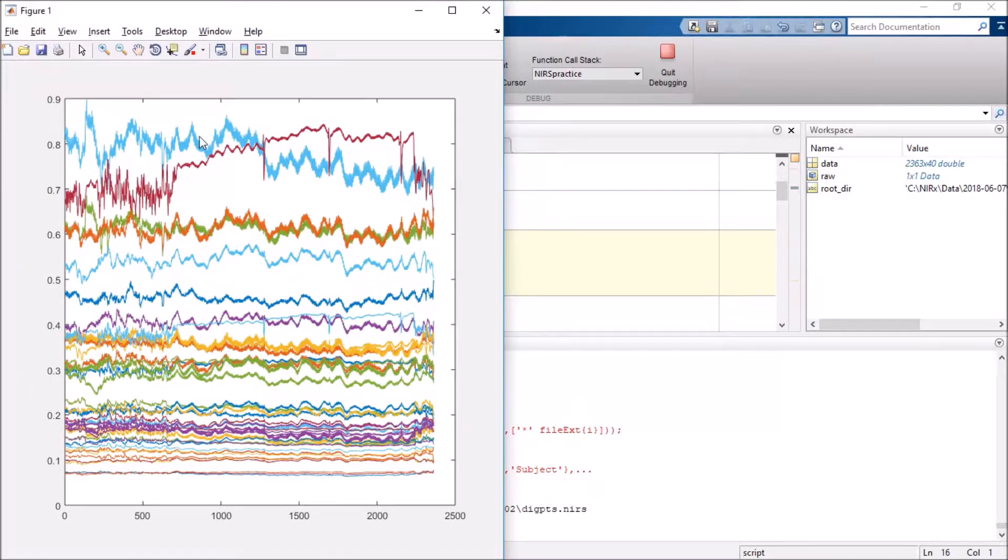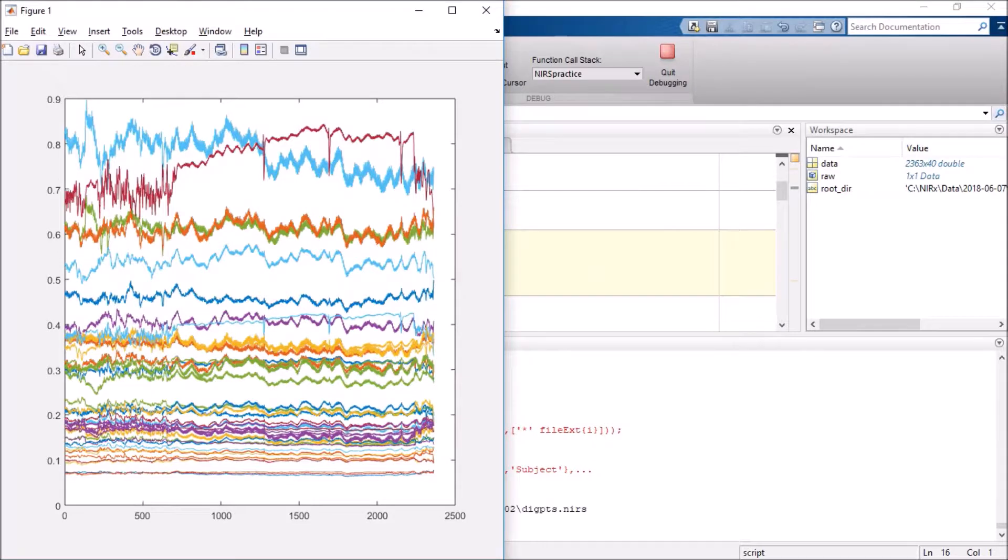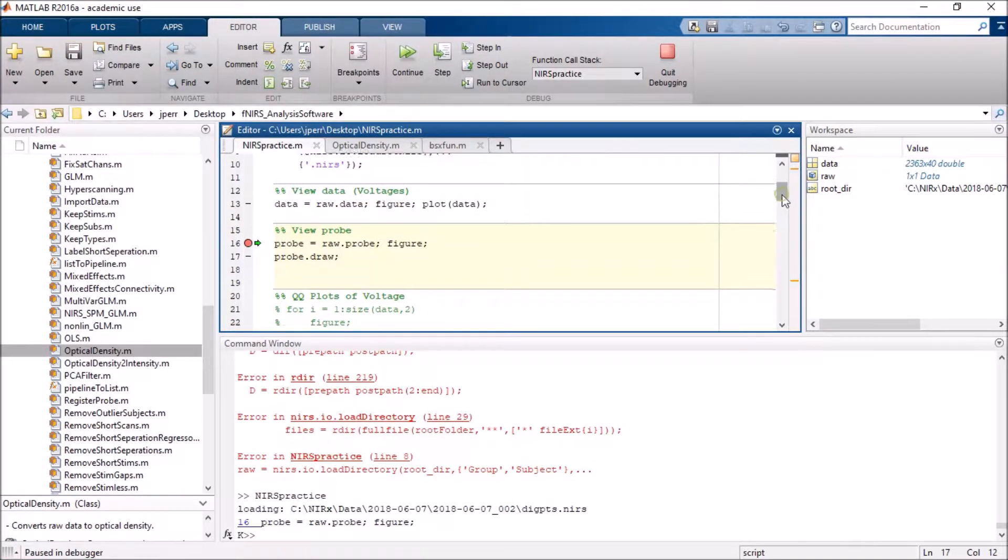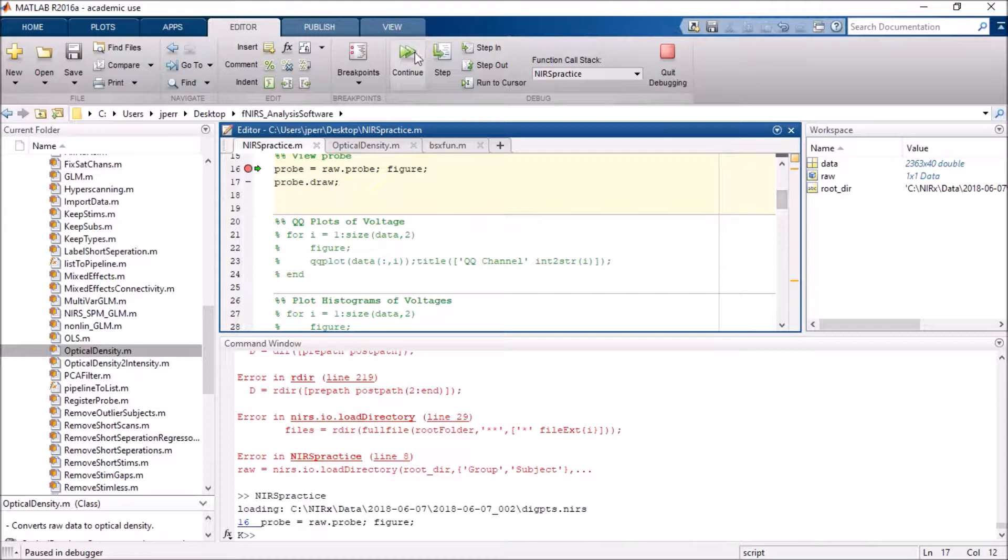So this is raw data per channel. Once I do that I have the option to draw the actual probe, and I'm actually just going to motor through here.